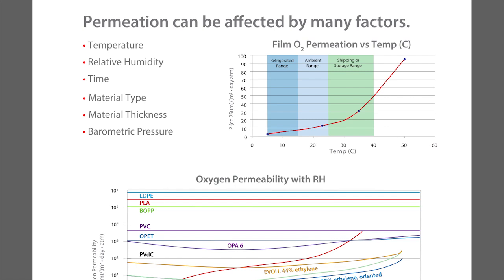So here's just an example of a material that, if it's analyzed at different temperatures, you can see a higher permeation rate going on with that. More flux goes through, more water goes through, more oxygen goes through. So it's kind of important what temperature we're analyzing at. The examples, typically water vapor has been standardized around 37.8 C, which is 100 F. So you'll find a lot of spec sheets around that, which is near like a human body temperature.